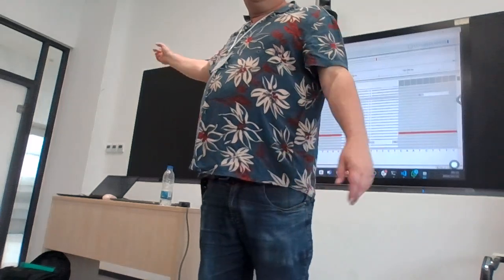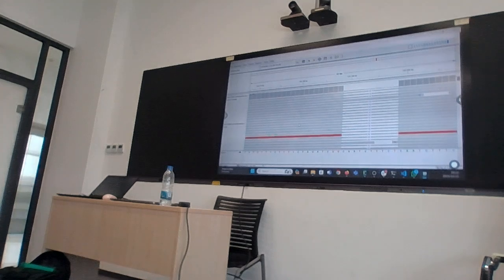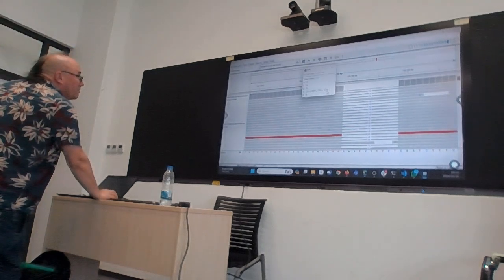Okay, so if we look to see which gene is impacted by this mutation, that would be interesting because some protein will not be made, right? But anyway, this is a deletion. If you saw an insertion, you'd see another character, but this is a deletion, and you can see the depth. And one last thing I want to show here.